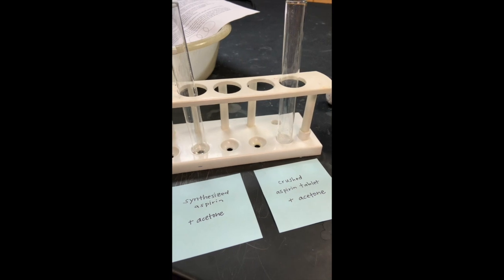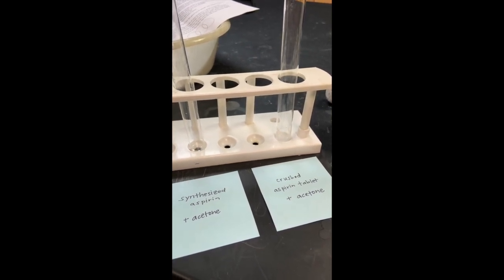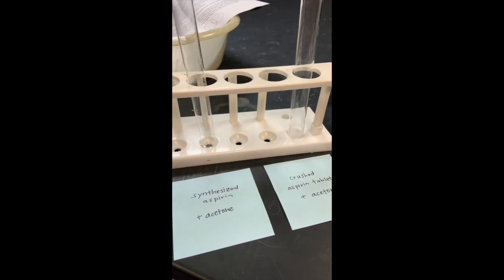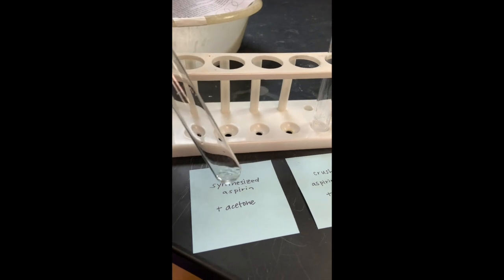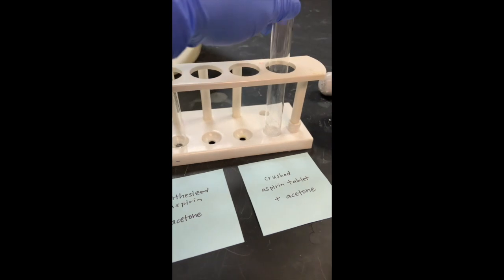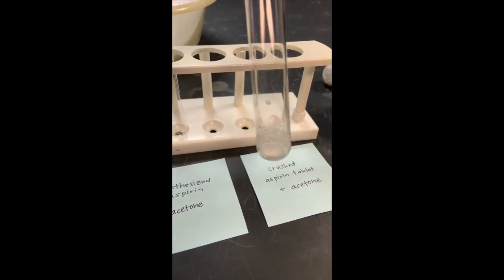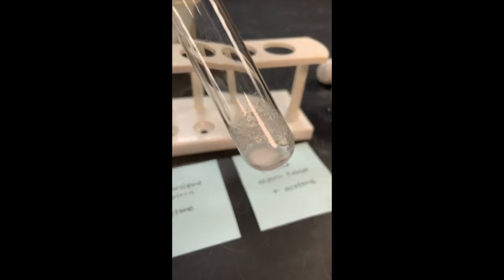I just mixed 1 spatula tip full of my crushed aspirin tablet with acetone and my synthesized aspirin with acetone. So my synthesized aspirin dissolved really well. My crushed aspirin tablet did not dissolve very well. It looks kind of chunky.